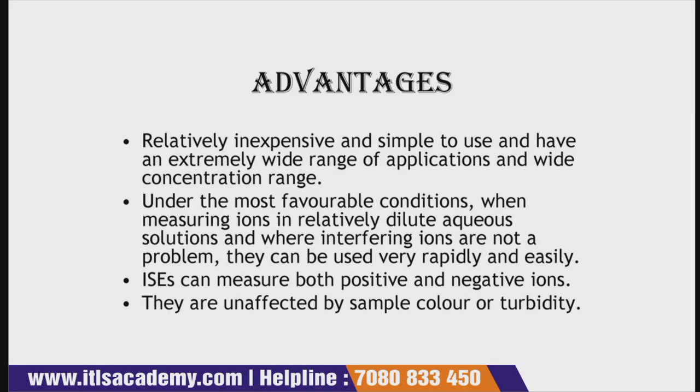It is relatively inexpensive, meaning there is no high cost, and it is very simple to use, meaning you don't require any additional training to operate it. It has a very wide range of applications that we have already covered, and it can be used over a wide range of concentrations also.